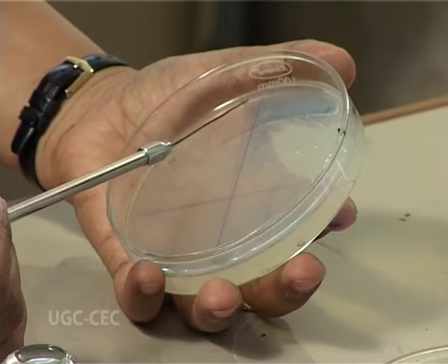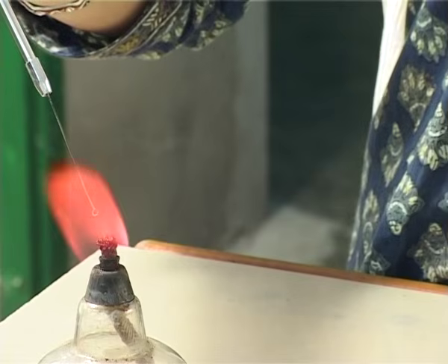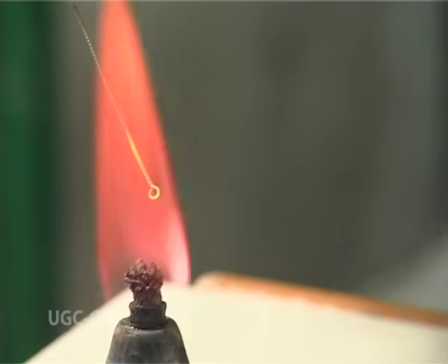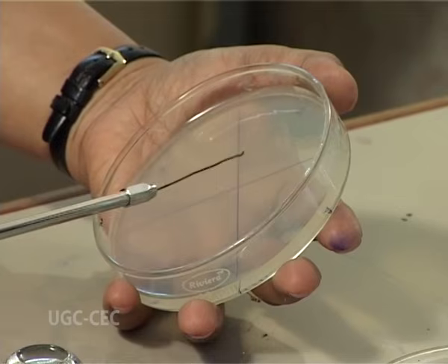So, you make the quadrants like this. You are done with the second quadrant. You again burn your needle and then go on for the third quadrant, and then similarly burn your needle and go on for the fourth quadrant. So, after the plates have been streaked, we now again invert the Petri plates and put them inside the incubator at 37 degrees Celsius, and let us see the colony development after the overnight culture, that means after 18 hours.